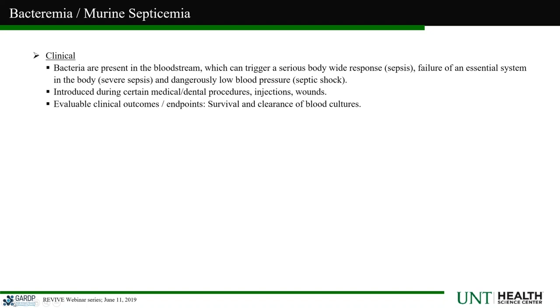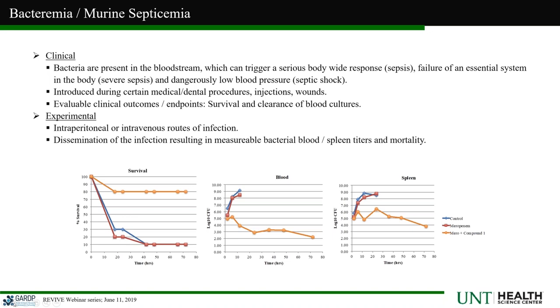Clinical evaluable endpoint for such a model is usually survival. Whether or not the patient dies or not is obviously a very clear endpoint. Or monitoring blood cultures and looking at clearance of the bacteria from the blood culture. So if you look at an animal model for septicemia, you're injecting the bacteria, again, going back to you've got the right inoculum, you've already tested this out, you know the strain you're using.